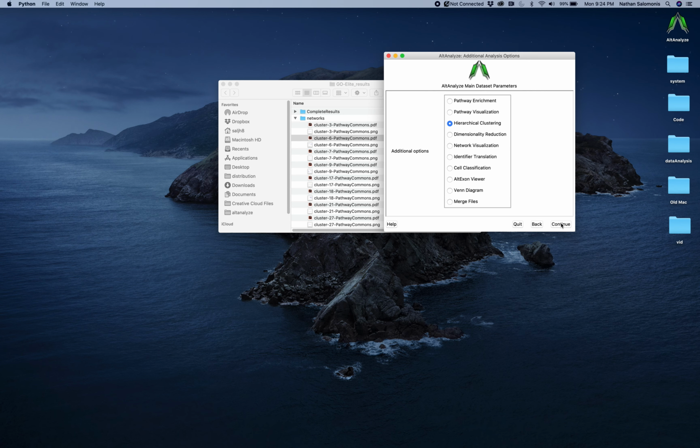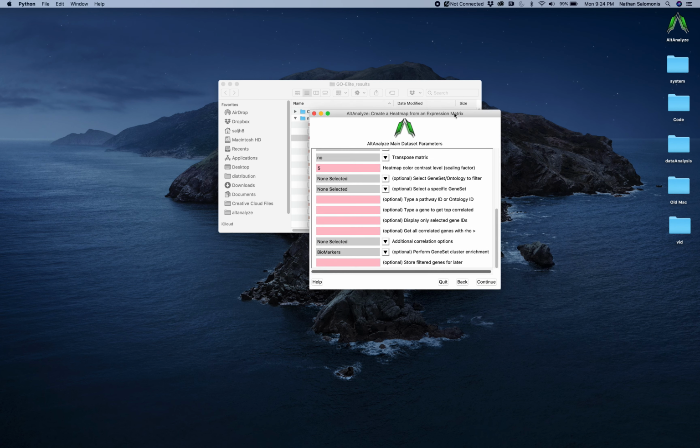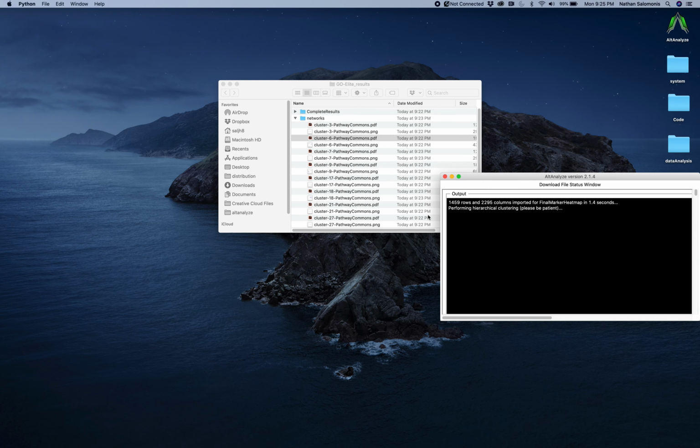There are a number of gene sets in the software, so not just these pathway-based gene sets, but there's actually specific gene sets that indicate what cell types these likely are based on prior described marker genes. So in this case, these are marker genes that are obtained from over several hundred data sets, I believe, studies, and over 1,000 gene signatures for, in this case, mouse, that exist that you can also analyze using the same method.